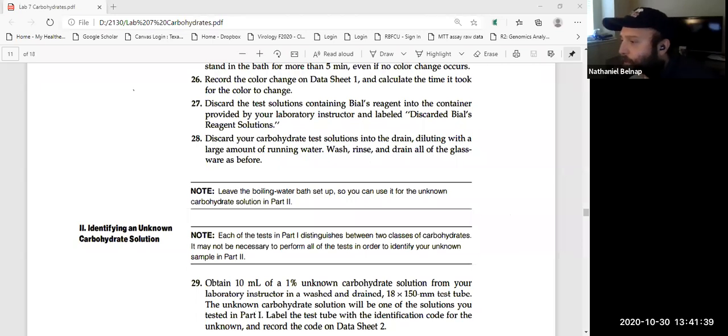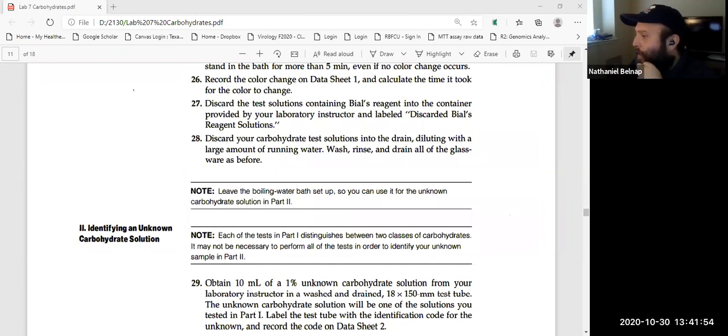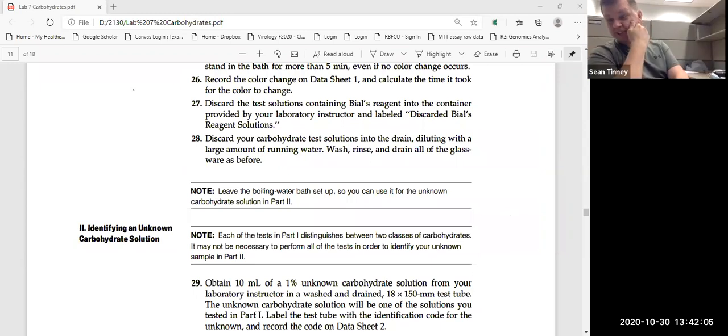Oh, here, is it this one? Right here. I thought we're doing 0466. No, we're doing 0446, qualitative carbohydrates. You're right, Trey. BARFOED'S, you have to wait a full 10 minutes for a full reaction. Or 2 to 3 minutes, but it's not like positive. Oh, you still have to, and you negative. You still have to monitor it for a full 10 just to be able to see if it's going to change for the final disaccharide. Yeah.